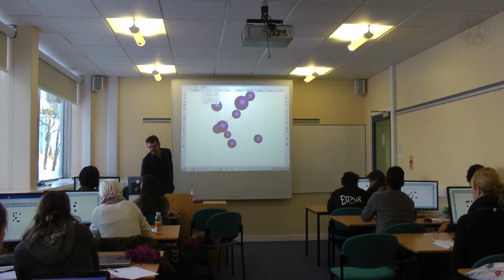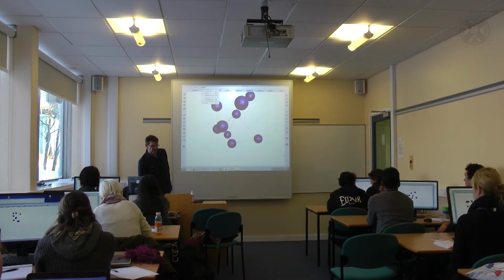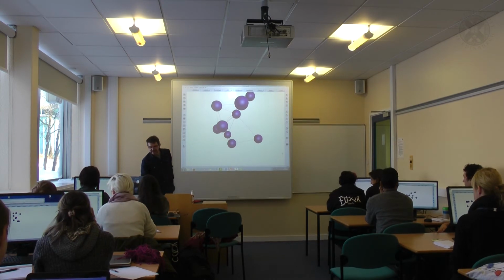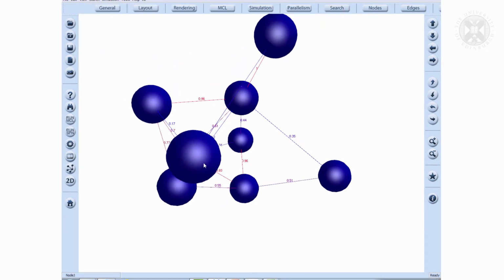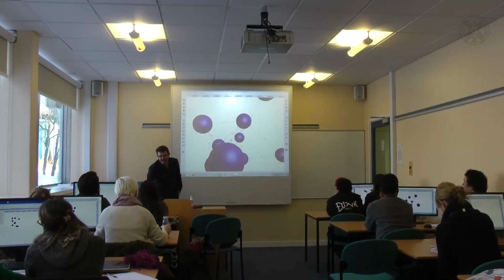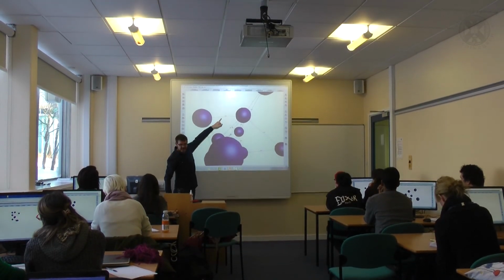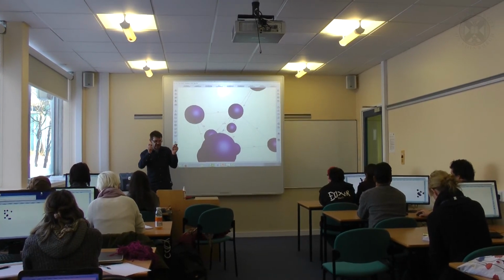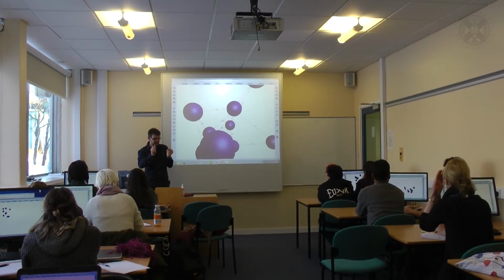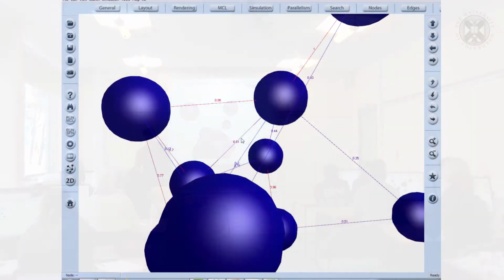Most of our life is focused on nodes, but edges do matter. And in this case, as I said, what we have done is introduce a weighted graph. And you can see here that the redder an edge is, the higher the value associated with it. So the tool takes that edge weight and then turns it into a colour description that allows you to look at that as a colour.